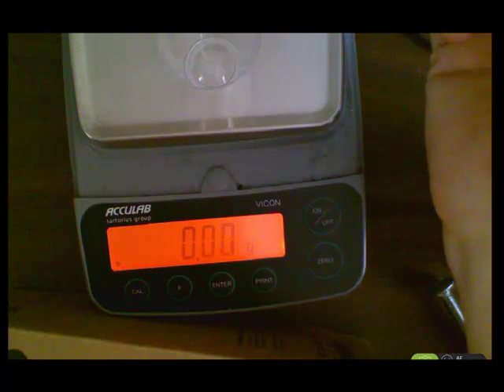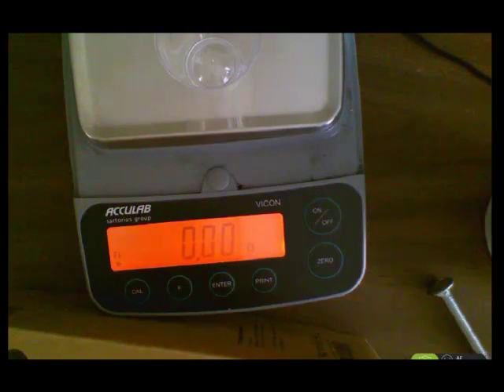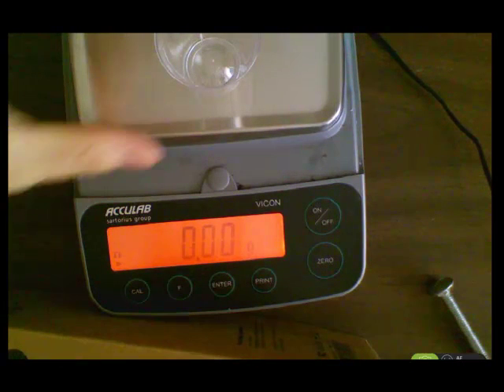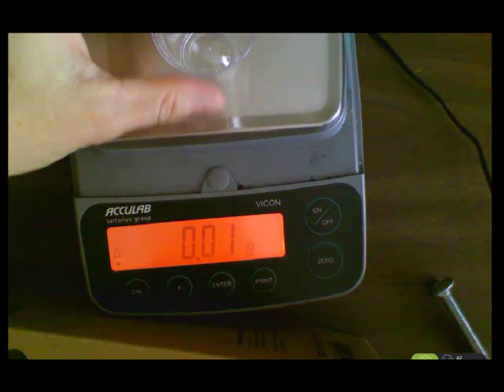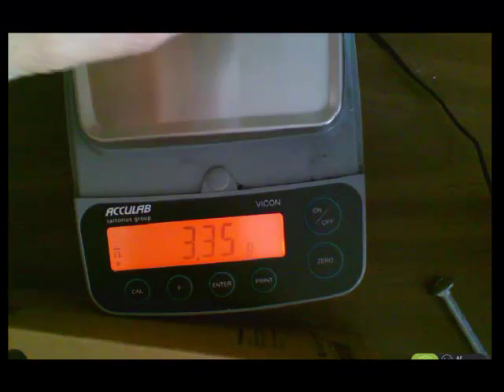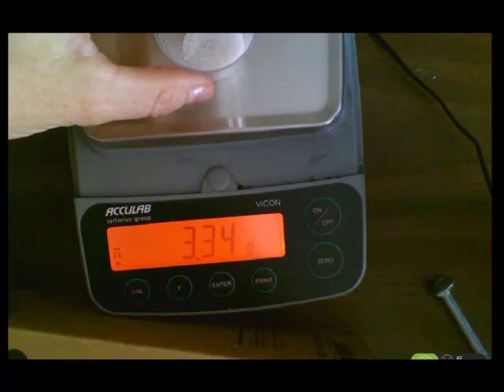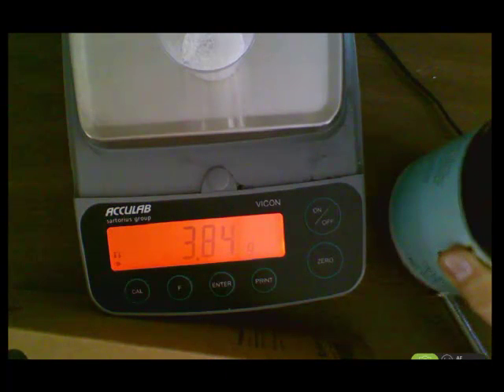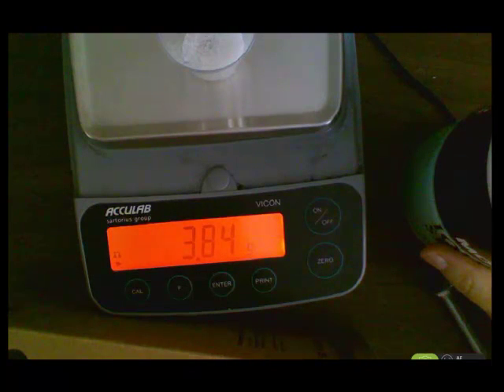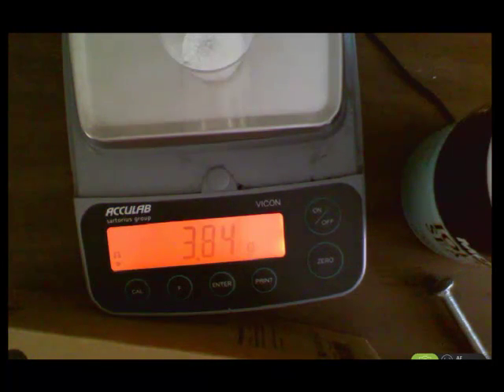Okay, so I'm going to put that back on there, and then I can put in the cup whatever it is I want to mass. So let's say I want to mass some salt. It's best to take it off so you don't spill any salt on the pan, because then you'd have to start over if you did that. And I'm going to put that on there. So there's my salt. So I'd record the mass there as 3.84 grams of salt. So that's how you use our digital balances.